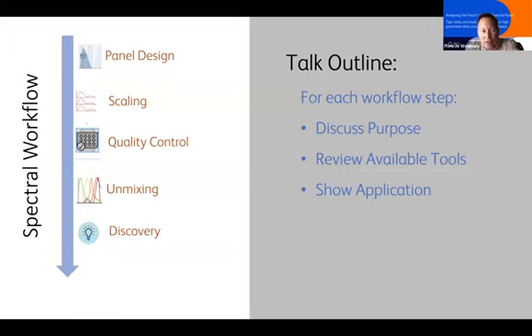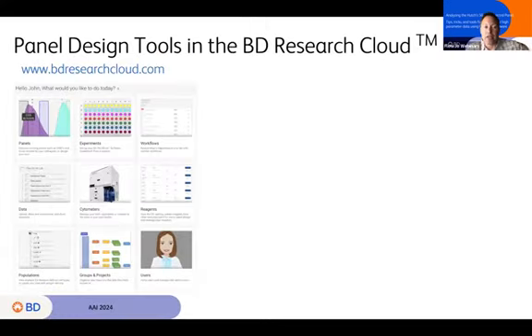And so you can see from the outline of this talk that the focus is going to be on a lot of upstream discussion. And we'll just do a little bit of what I refer to as discovery at the end, talking about applying some high dimensional tools to this data. So let us start with panel design.